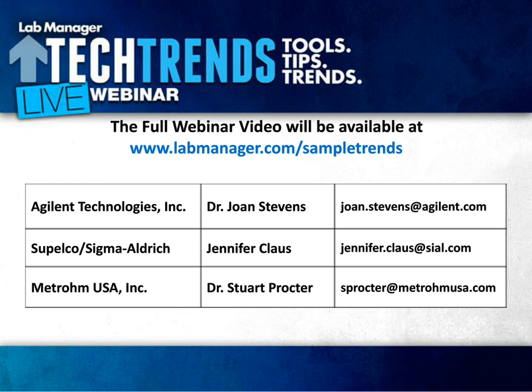Great, thank you. Any other additions there? I just wanted to add, we have a number of requests from our customers regarding different procedures, using methylene chloride or hot toluene. There's always requests for us to find different ways to do the sample prep methods with greener solvents, such as water, acetonitrile, or various other solvents that aren't as scary, I guess.